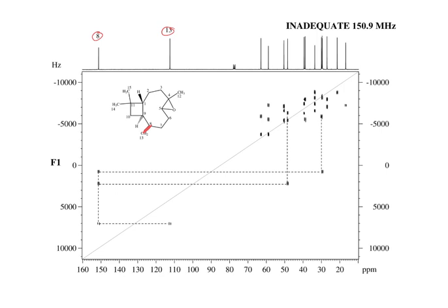The other issue is that remember the C13 T1 values are much longer too. Especially quaternary carbons inside of a ring, they could be like 10 seconds, or maybe even longer. That means you'd have to wait a long time between pulses too. So what they did is they added a small amount of a paramagnetic species to cause the relaxation to be much faster without being too fast, right?